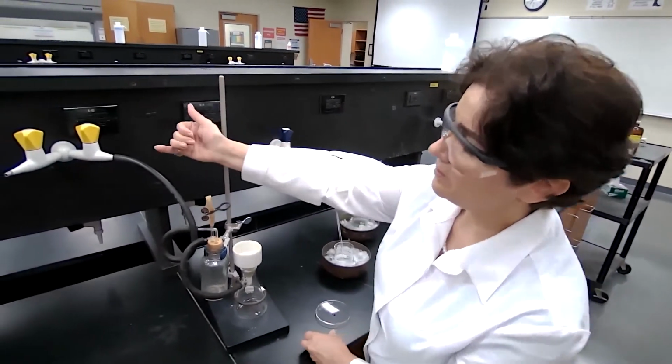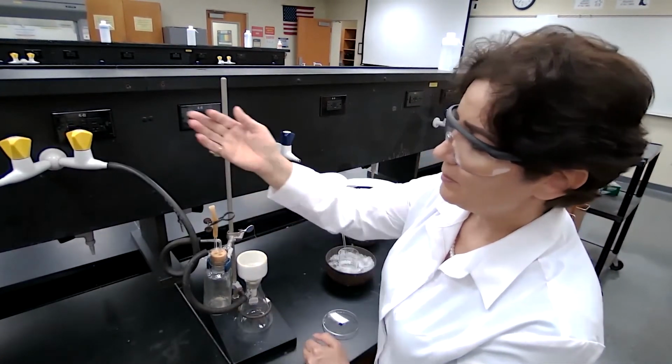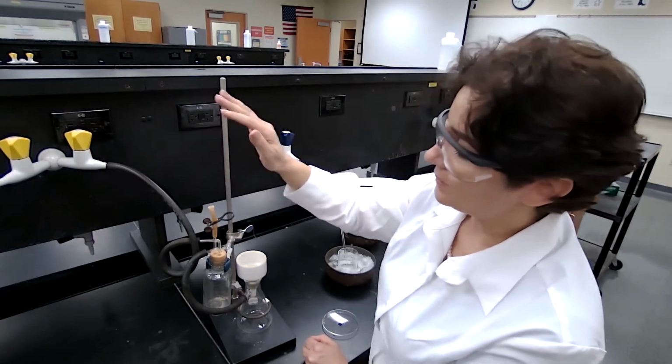The way this vacuum apparatus setup works, it can also work with a water aspirator, but we do have a vacuum pump downstairs. We just turn on the vacuum and it operates here.